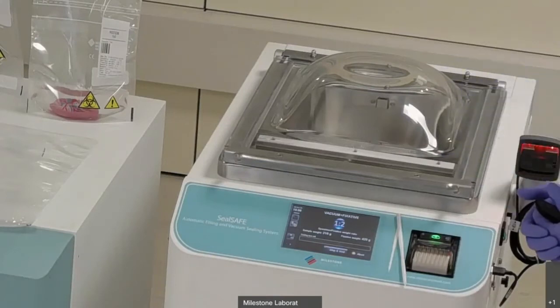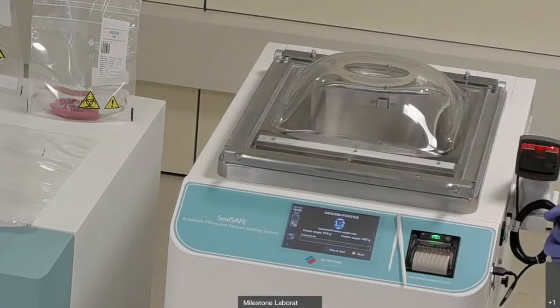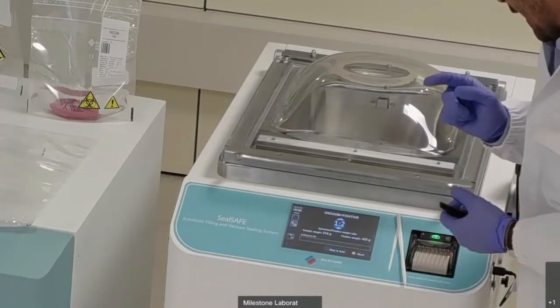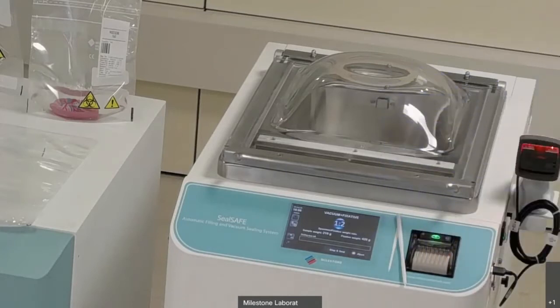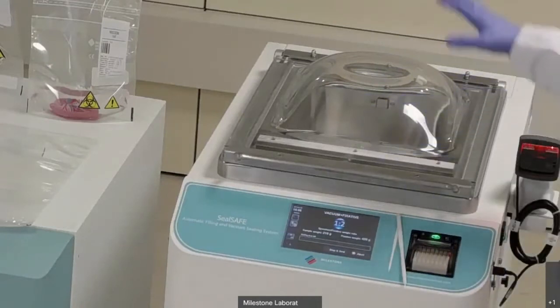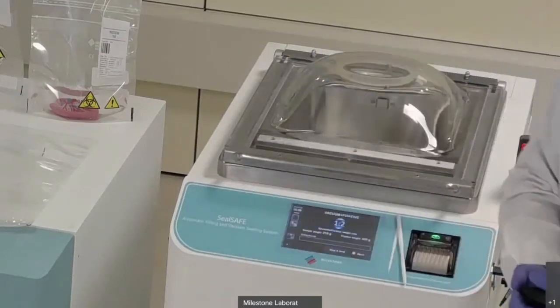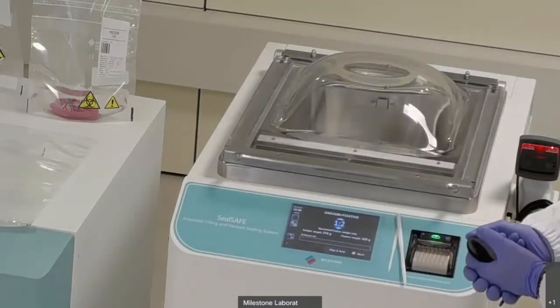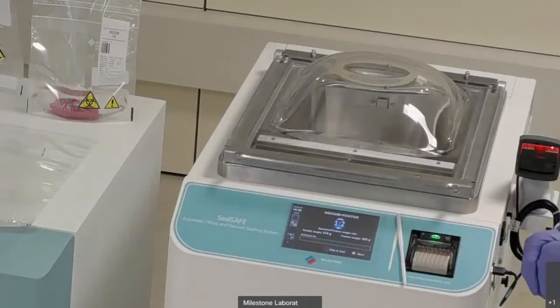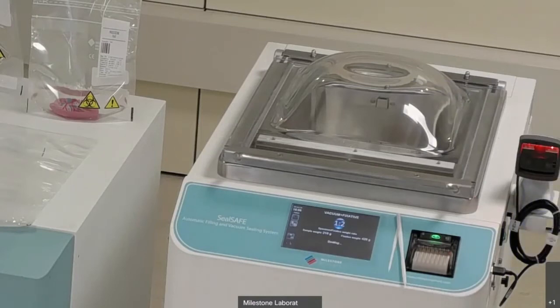Now the procedure is terminated, and the sealing is getting completed. As you can see, up to the end of the procedure, I was never in contact with formalin, because all the dispensing of formalin takes place inside a protected environment. Now the bar is sealing the bag, and I will get a label with all the information.